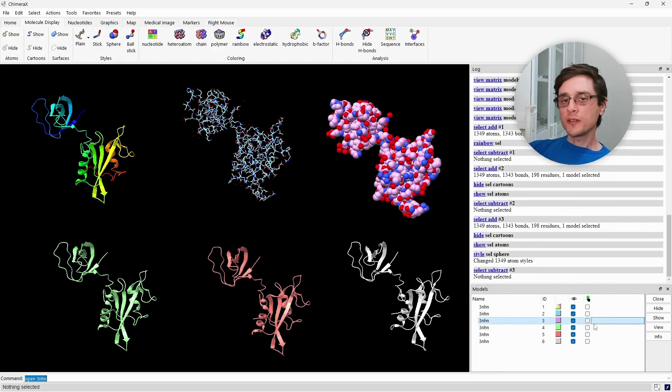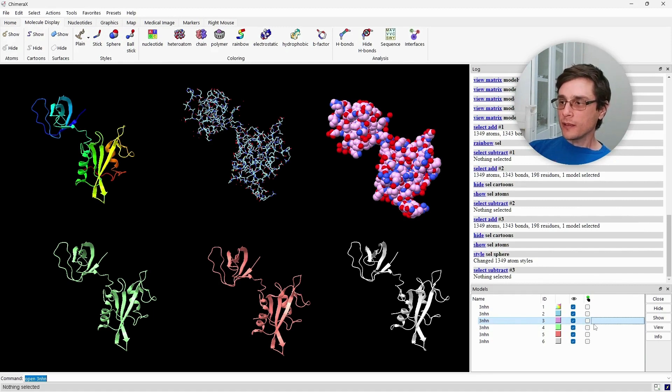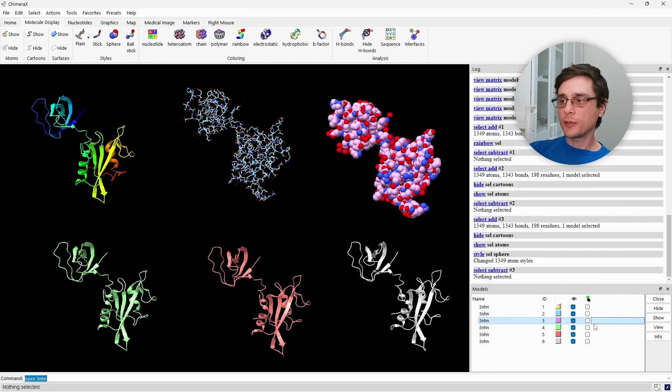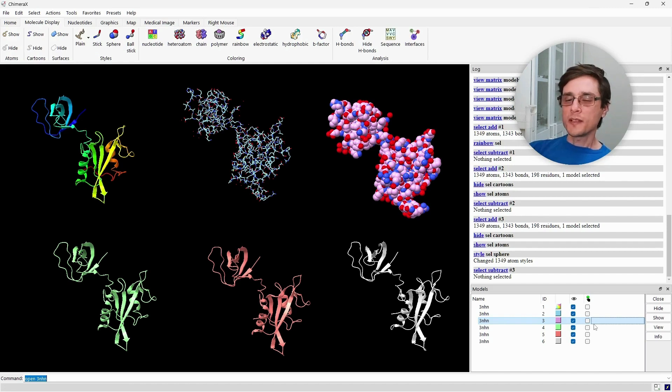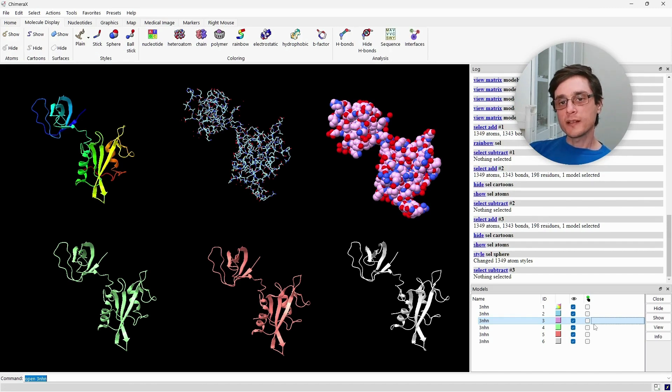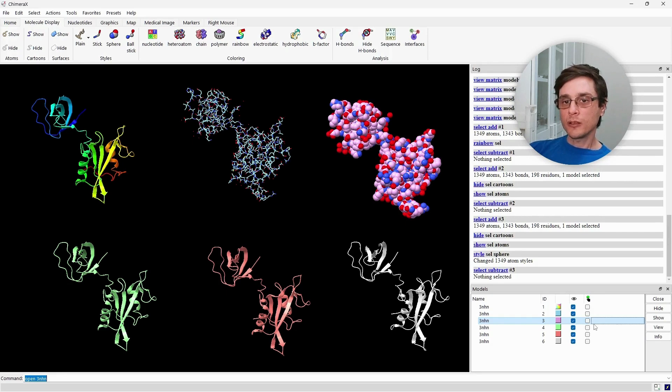The sphere representation gets us an idea of how much space different parts of the protein take. For example, it shows us cavities where ligands can bind or surfaces that come in contact between monomers.